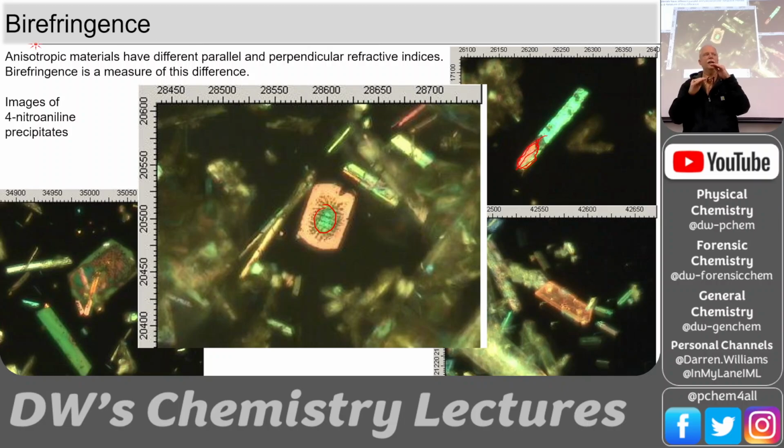But you can't say that red is always below green or green is always above red, because it's a circular path, like a spiral staircase. And so it's going through the whole rainbow all the way up the stairs in depth. And so these light paths are turning through this anisotropic crystal, going around, and whenever the spiral staircase hits the surface, it comes out, and you've got that color of light.